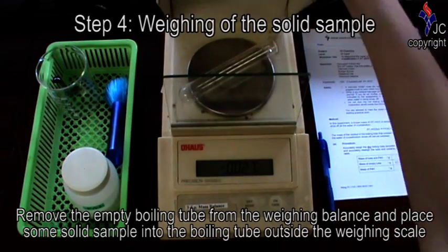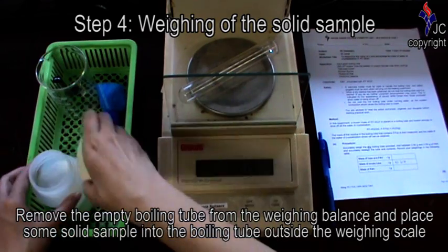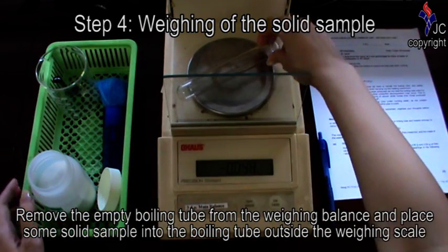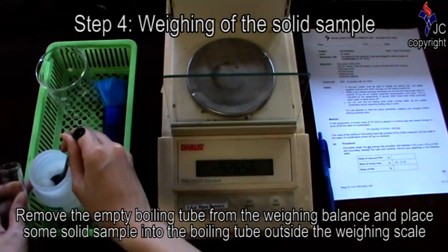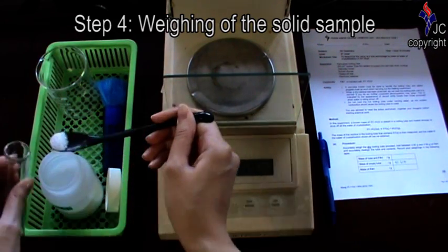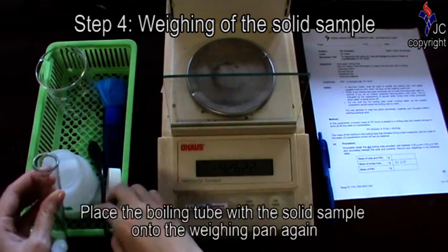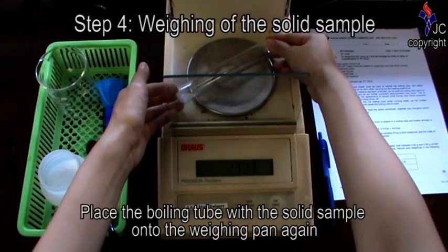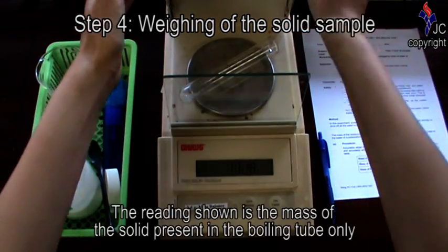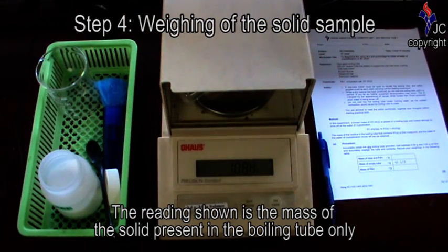Remove the empty boiling tube from the weighing balance and place some solid sample into the boiling tube outside the weighing scale. Then place the boiling tube with the solid sample onto the weighing pan again. The reading shown is the mass of the solid present in the boiling tube only.